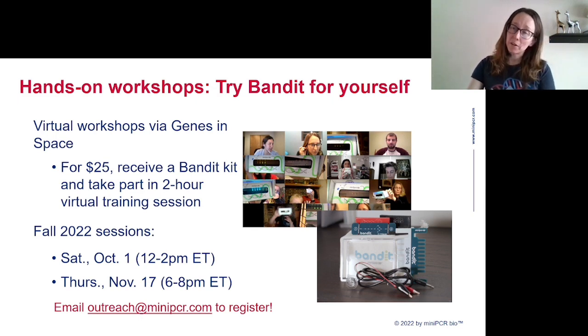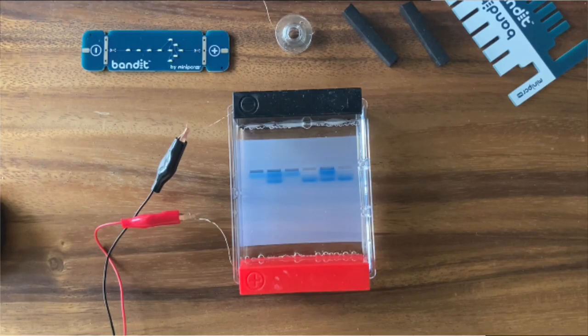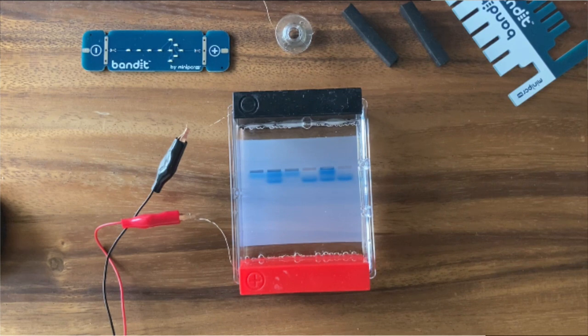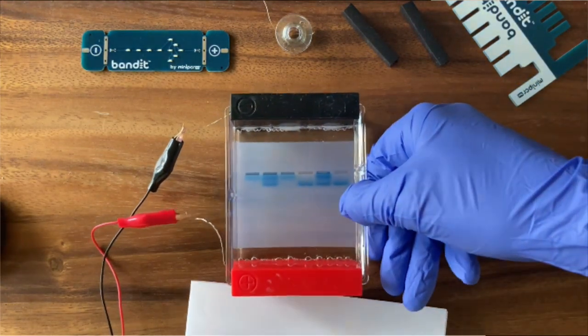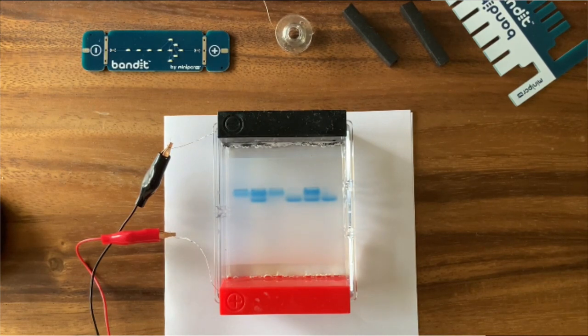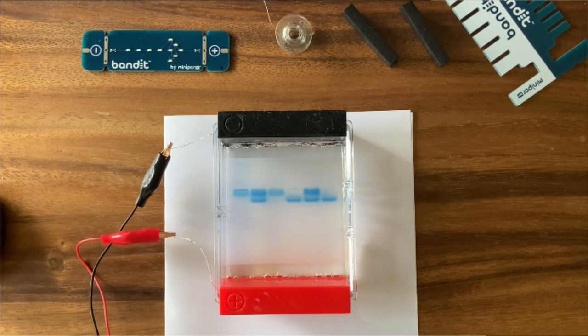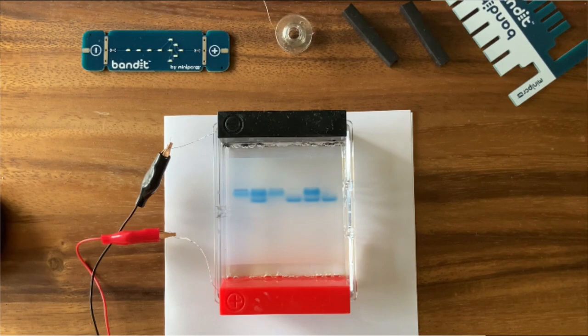We've run our gel for a few minutes now. We won't see our full results just yet, but we'll be able to see some movement in our gel. Our gel has just been running for a few minutes, but we can already see our bands and some separation here. I'm actually going to put a sheet of white paper underneath this so you can see our bands even better. We've been running for a few minutes, but we can already see some of our samples. It looks like we're just seeing one band that's run out. Some we're seeing two bands, so we're able to resolve and get some separation for those samples that contain multiple molecules already.